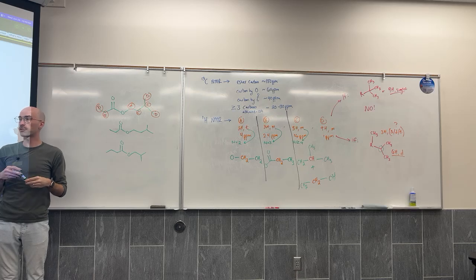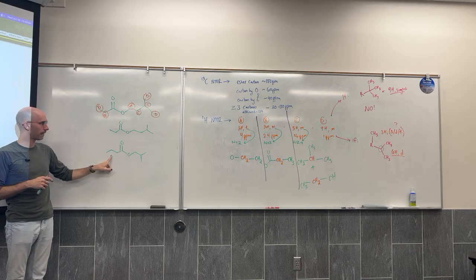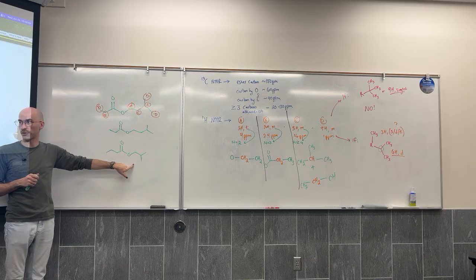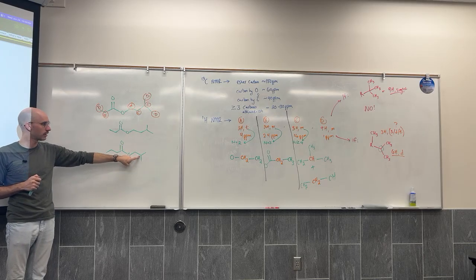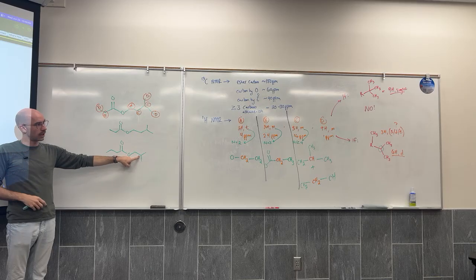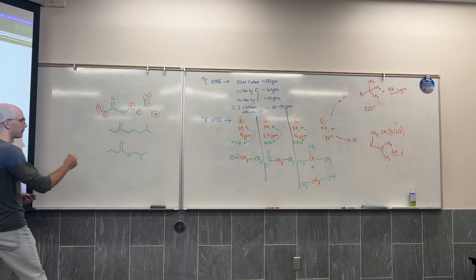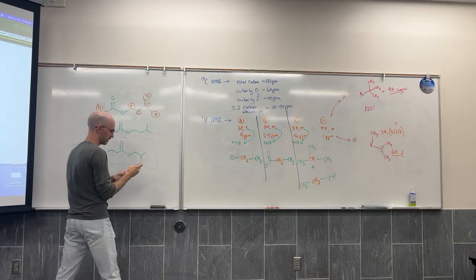It is a structural isomer. So same chemical formula, different connectivity. How would we distinguish? It's this signal, this 2H. No. It's the 2H that's in here. Oh, okay. No, I think you are right. I think it is this one. In which case, let me label.